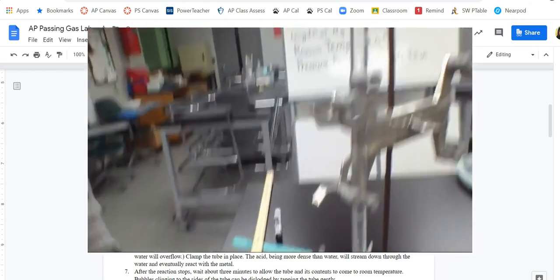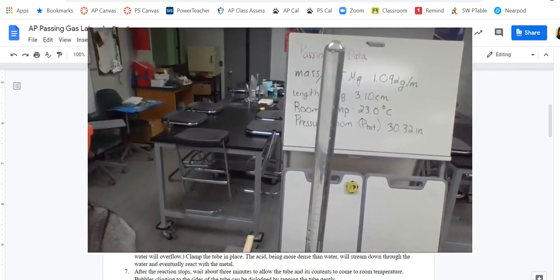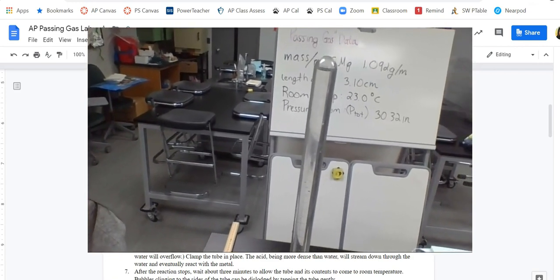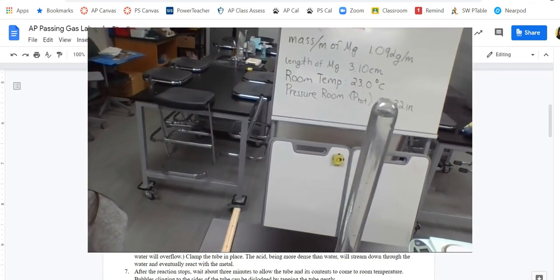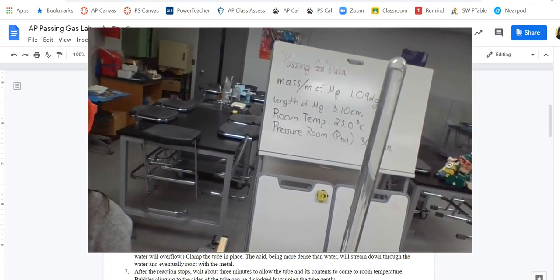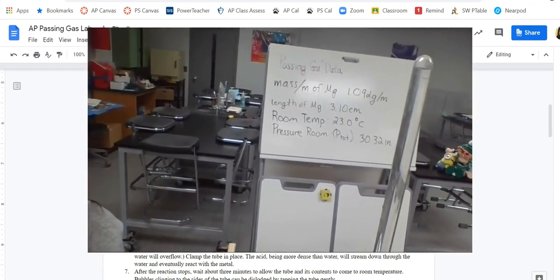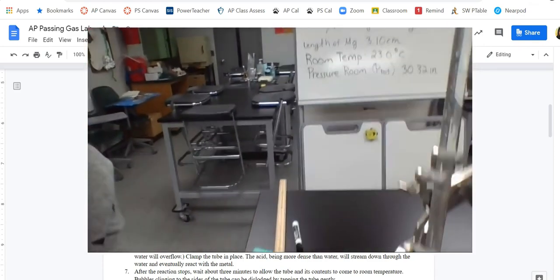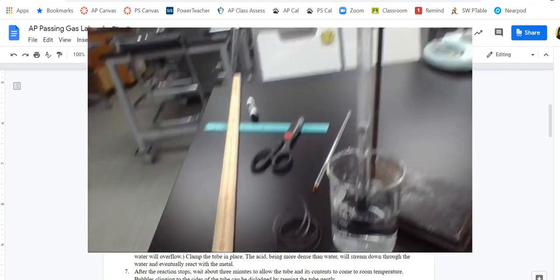Now, I can see bubbles, and let's start seeing what's happening up at the top. Oh, what? I know when I flipped that over, that was full all the way to the top, and now I can see that there's gas being created. And we know that since the gas is less dense, the gas should be rising. So we can see that gas rising through the liquid. Well, where's that liquid going? Well, that liquid is actually leaving out of the bottom. Let's see if we can see it.